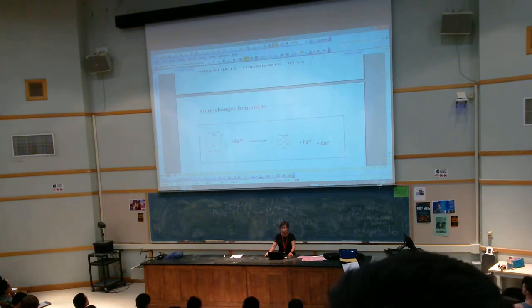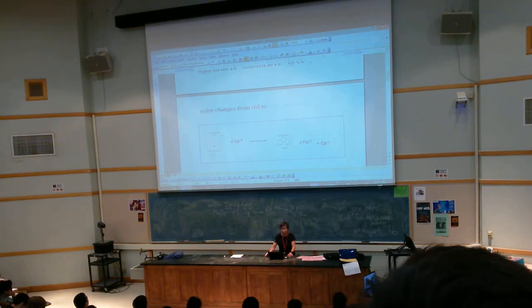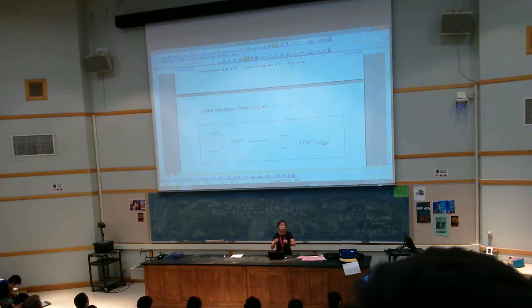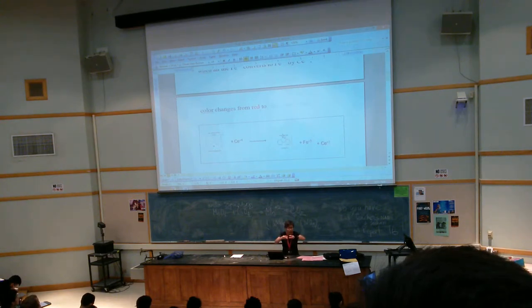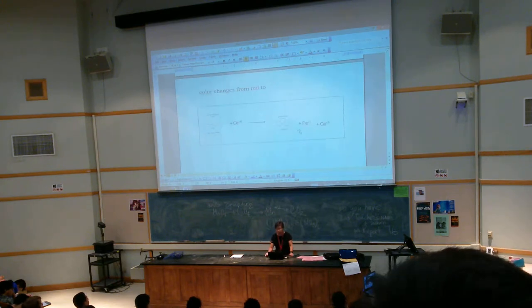This is what happens. The orthophenanthroline with the Fe in it is a red, orange, reddish color. Okay? When the cerium oxidizes the Fe plus 2 to plus 3, the phenanthroline releases that Fe because it only binds to the Fe plus 2. When it releases it, the phenanthroline itself is kind of a clear color, but you see a light blue, right? You following me so far? If you're not, you read before you come here and then read again before you start the lab, okay?